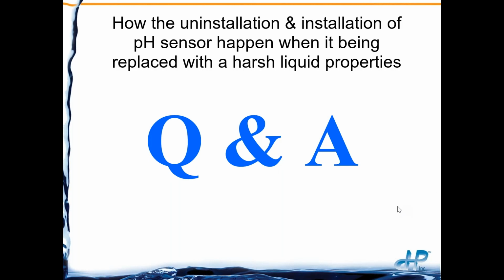Okay, so the first question here is, how does the uninstallation and installation of a pH sensor happen when it's being replaced with harsh liquid properties? Okay, the term and the question don't make sense to me. The uninstallation and installation of a pH sensor, you're physically meaning you pull it out and put it in? Or can you give a little bit more?